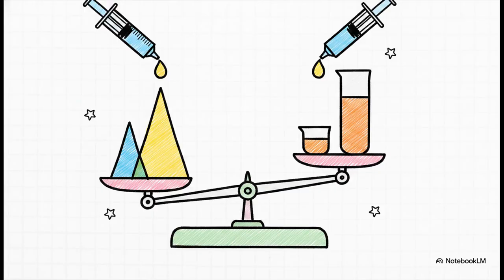And this brilliantly illustrates the power of using perfectly identical injection volumes. Because we injected the exact same volume of liquid both times, the ratio of the peak areas perfectly mirrors the ratio of their concentrations. Therefore, the unknown concentration simply equals the unknown area divided by the reference area, all multiplied by the reference concentration. It is incredibly straightforward mathematics, yet wonderfully precise for finding our invisible quantities.